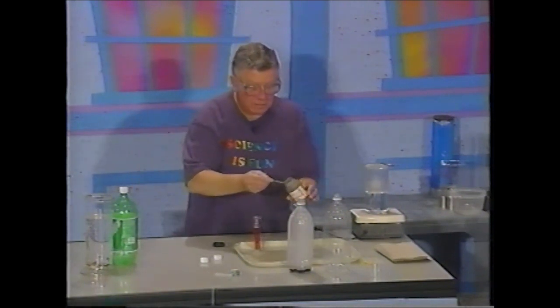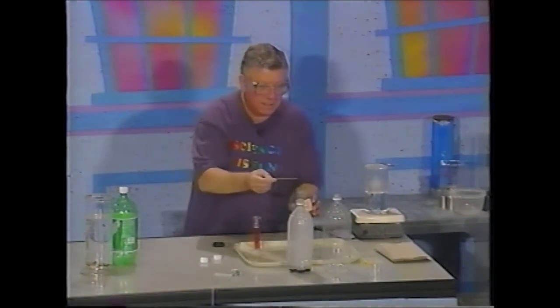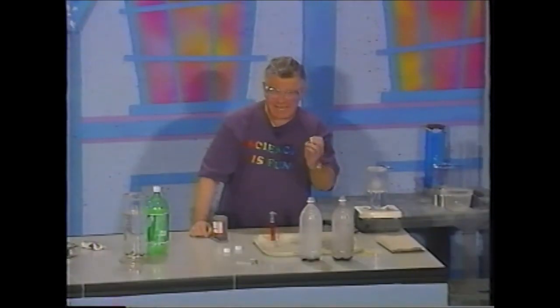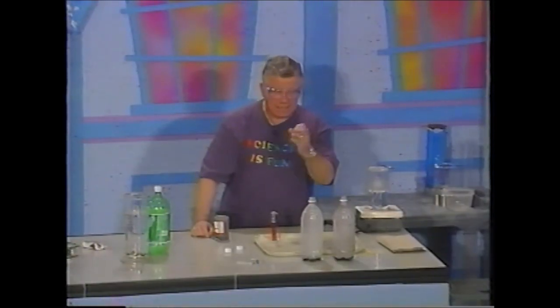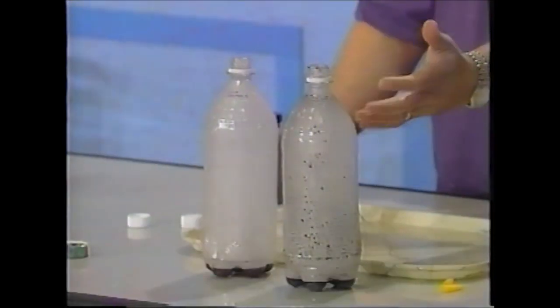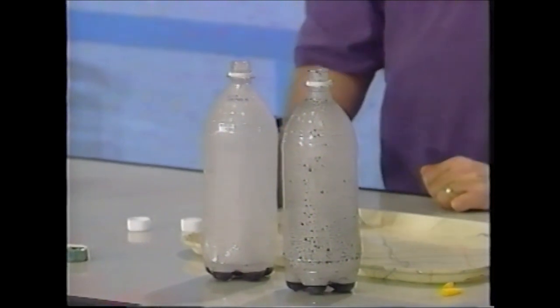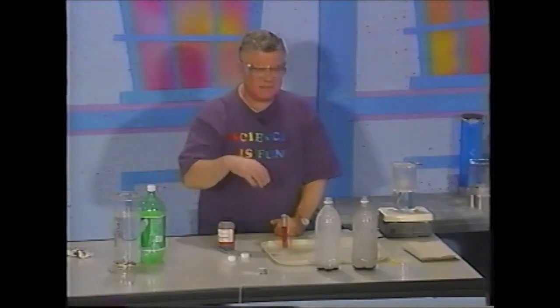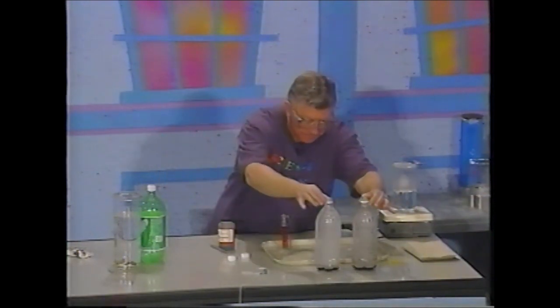So we're going to repeat the experiment one more time, and I'm going to do it with this other bottle right here. Okay, ready? Here we go. So what came out of the mouth of the bottle? Water vapor. It was hot, and then it condensed when it hit the cold air. And did this bottle shrink? Yes. So that's a very interesting experiment to look at in terms of the release of energy in the form of heat and the presence of a catalyst.